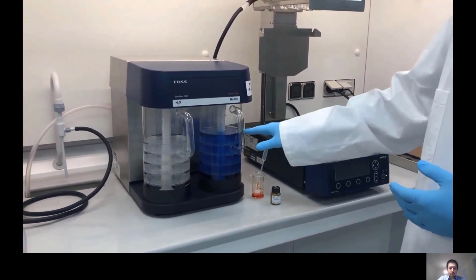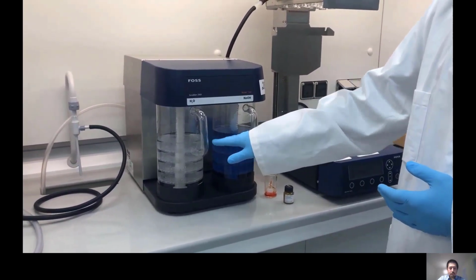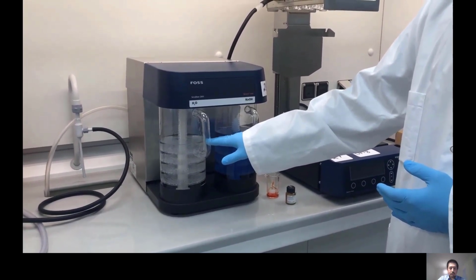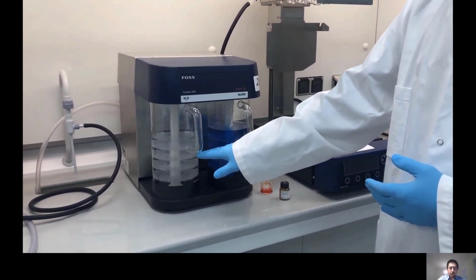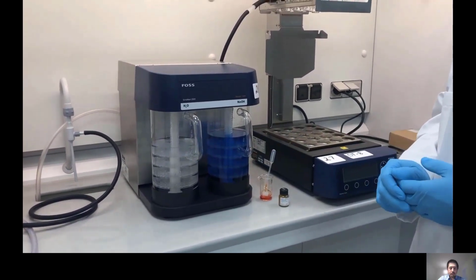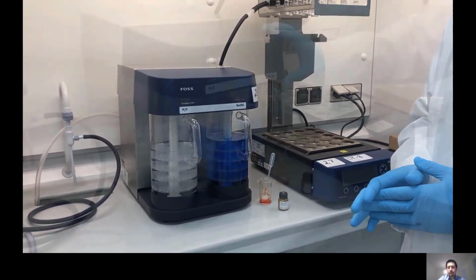And the liquid level for the water here is this, except when you have much moisture or water in the samples, you need to have 1/3 of water here. So that's how it looks when you start the digestion.